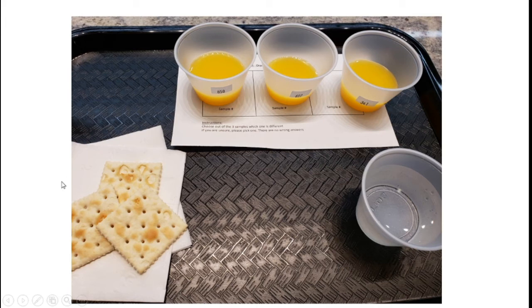In this case, with the paper ballot, do make sure that you have a pencil or a pen available to your participants. We've got the unsalted crackers and a glass of water so that they can cleanse their palate. Cleansing your palate just means you're removing any flavor that you may have had from tasting the previous sample. And in this case, it was orange juice.